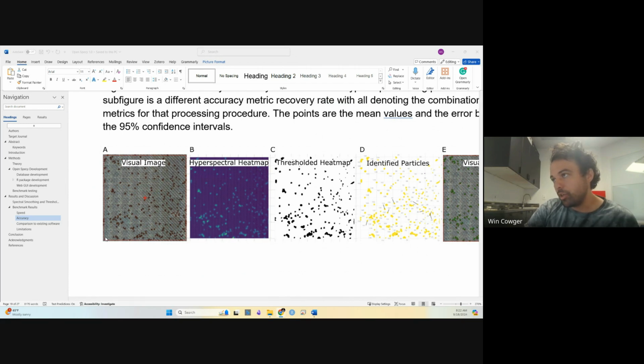This is a really good question. I should add this to the agenda. With a focal plane array, you might get like a 64 by 64 grid of 25 micron measurements at one time. So you might have this chunk of the filter that you're collecting data on.